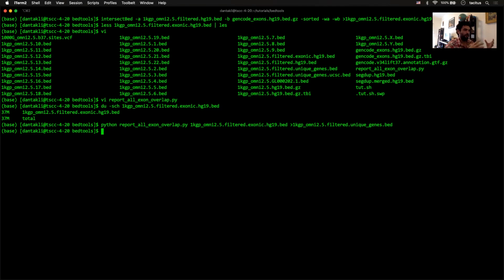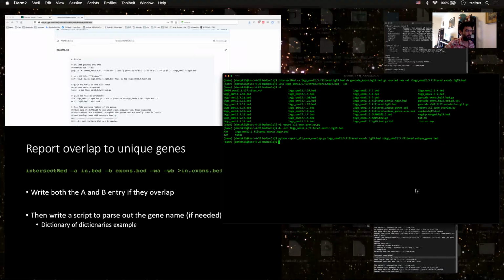So putting your data into the UCSC Genome browser is a good way to be like, yes, these are variants that are hitting genes, and it's real biology, these are real people that have these variants, and so it's a good frame of reference to do this.